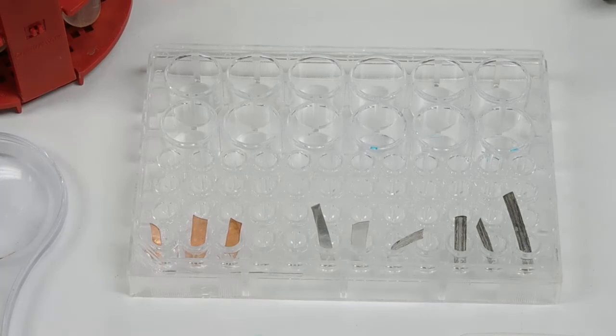Once I've established the relative reactivities of the substances, I can place them in order for each of the 6 metals, from most reactive to least reactive metal.